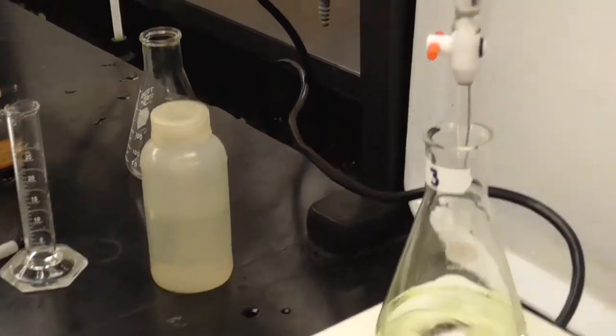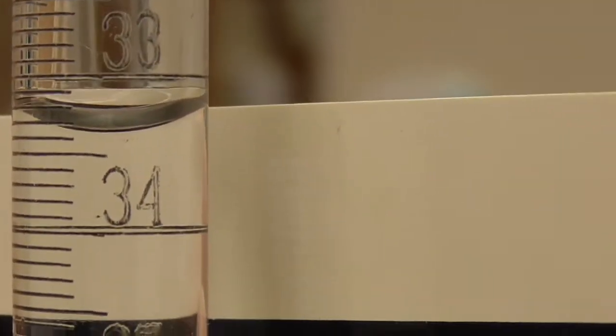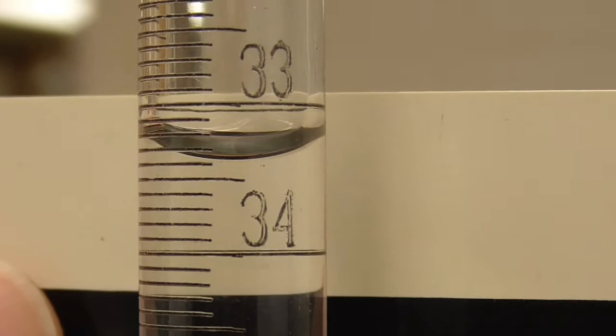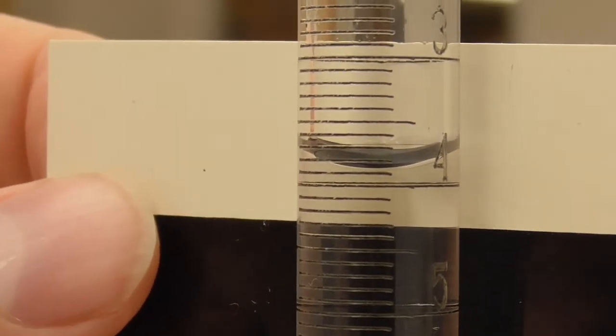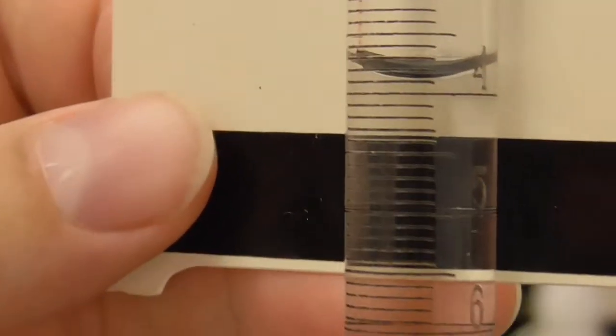So now we'll come back in and read the burette. Let's see if I can zoom in on this a little bit better. And Doctor, could you slide the card up a little bit? There we go. And there, now we can read the final on the burette. I'm going to pause this. Okay, this is the starting point on the burette for the 4th trial.